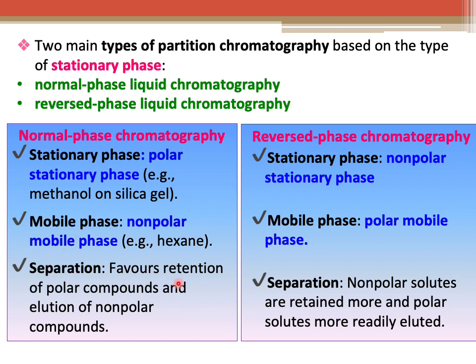And separation favors retention of polar compounds and elution of non-polar compounds. So, dia punya bergantung kepada ketelarutan dia dalam polar compound daripada non-polar compound.